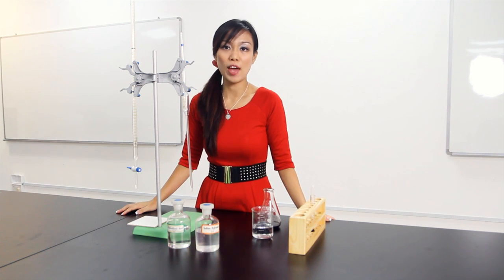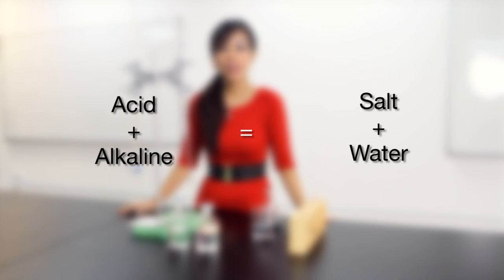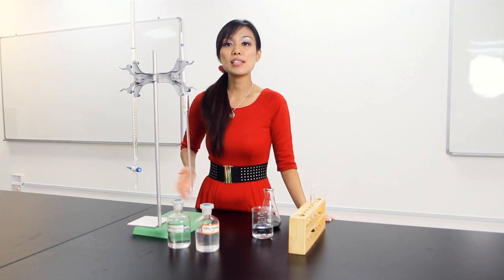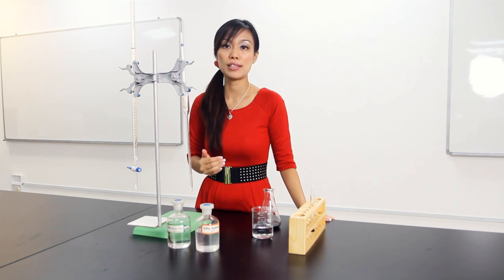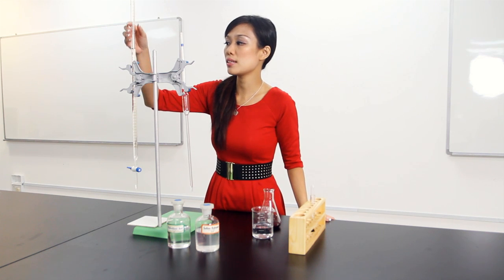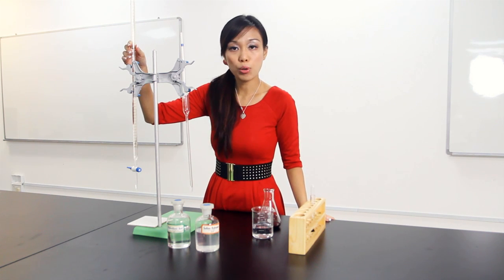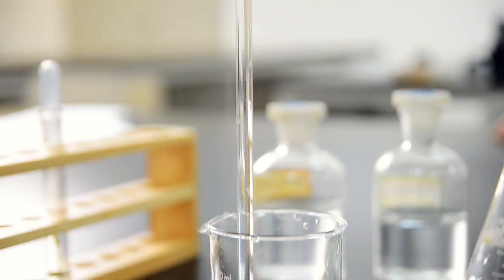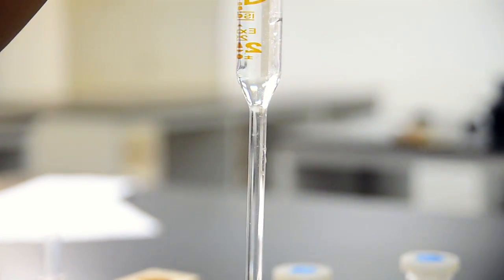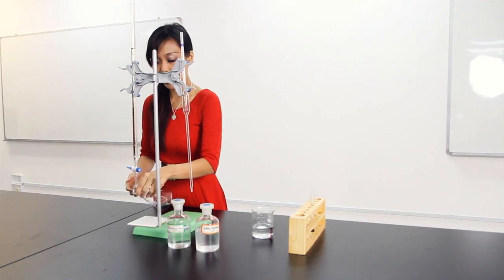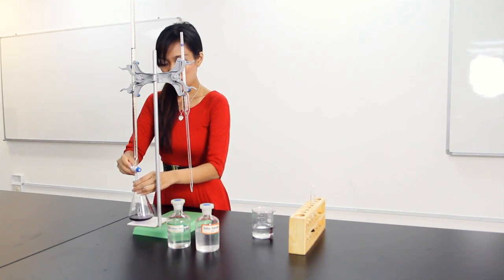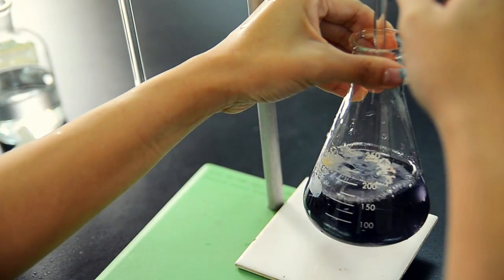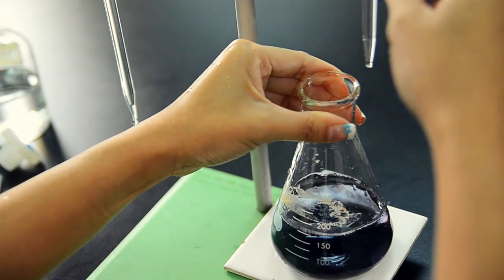Another very important reaction of acid is when acid reacts with alkaline. Acid reacted with alkaline will give you salt and water. This is a titration process and also a neutralization process. You can see here in this burette, I've already filled it with hydrochloric acid. I've also used a pipette to draw 25 ml of sodium hydroxide and place it in the conical flask. I'm going to start my titration process — I allow drops of acid to react with the sodium hydroxide. I will stop titration when I see the entire solution becoming green in colour.